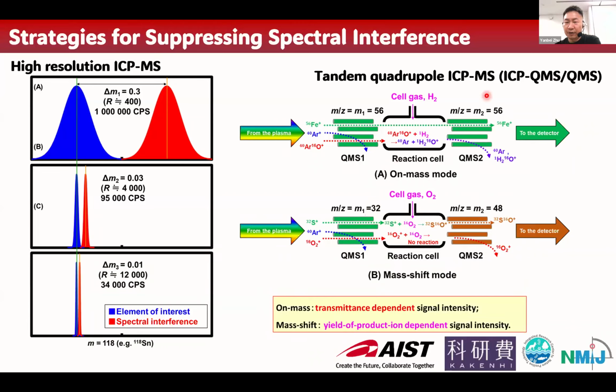This ICP-QMS provides very good capability for suppressing spectral interference.